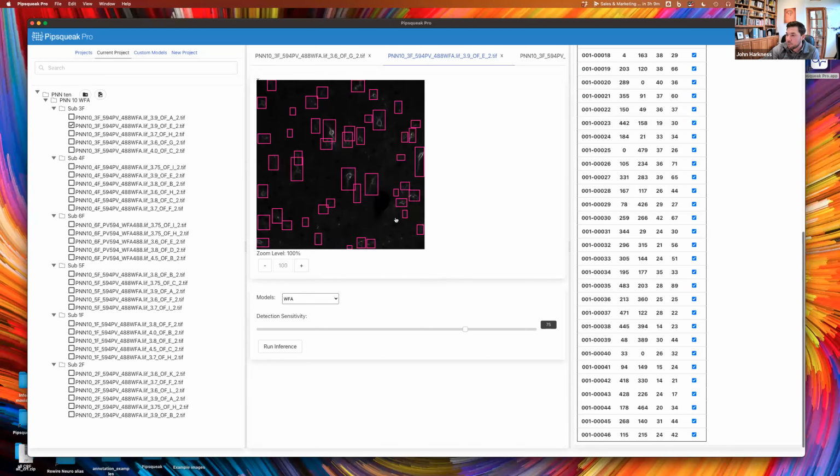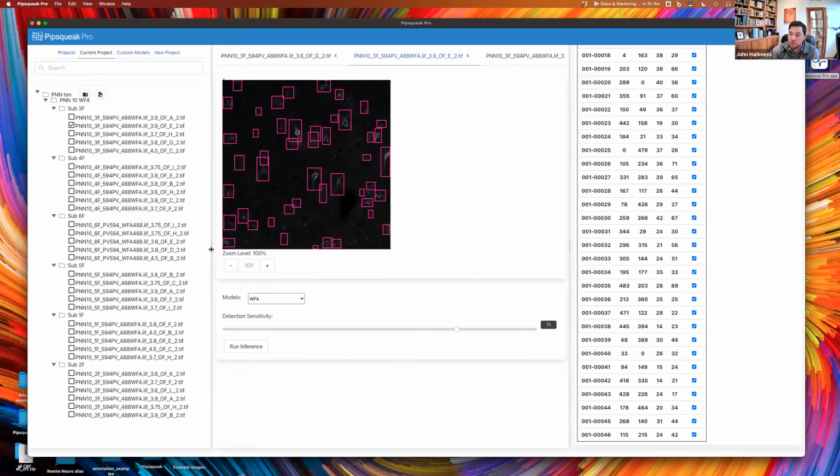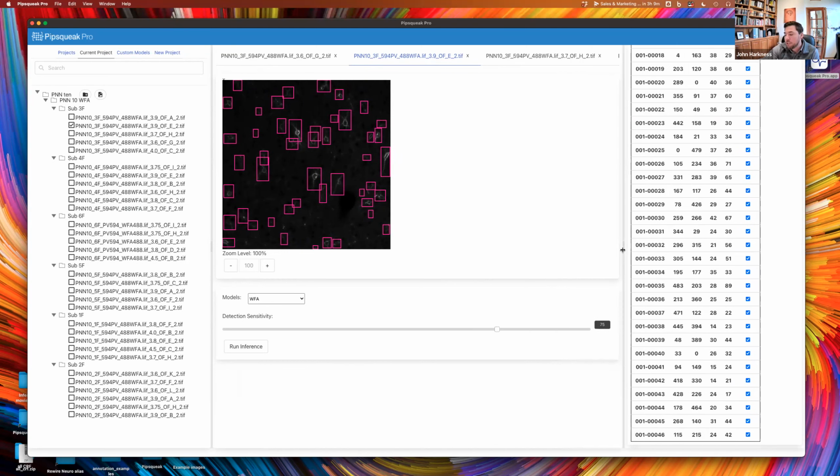But it's a really easy way to see the data come through this process pretty quickly. So yeah, Larry, really good question here. Our AI methods are extremely transparent. We really want this to be something that everyone feels comfortable with. And our approach on AI has essentially been that this platform, this AI is helping you detect the cells, but we really don't want to trust it blindly.